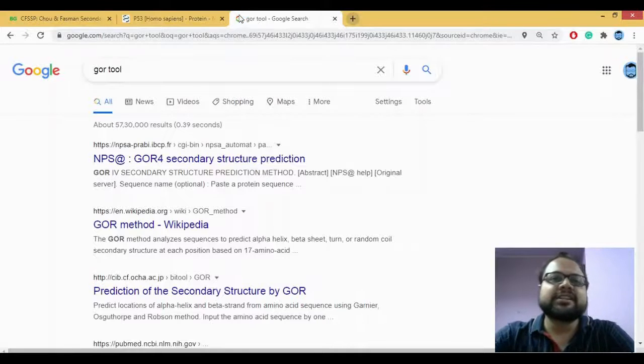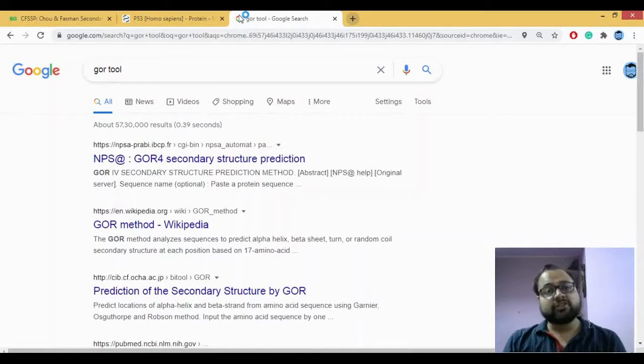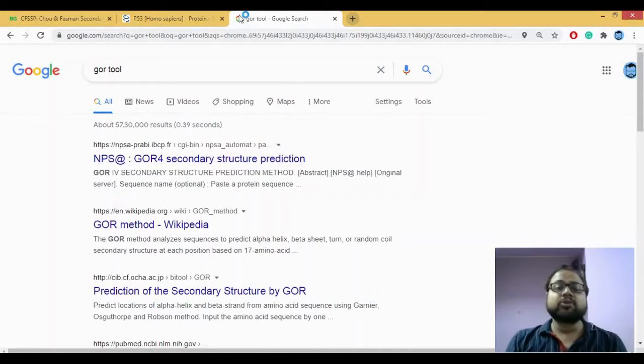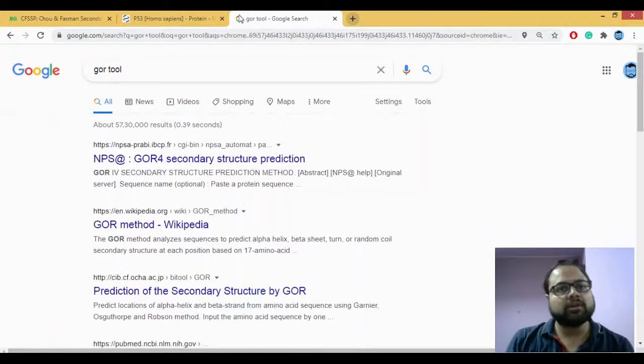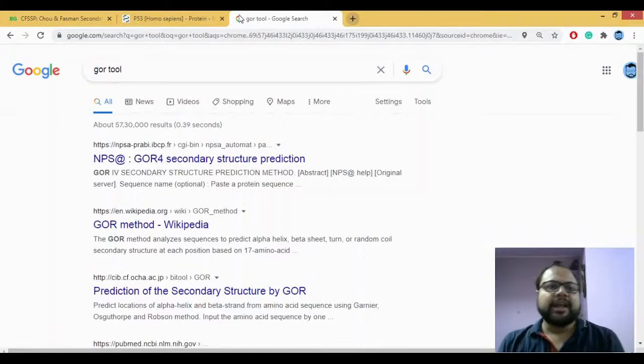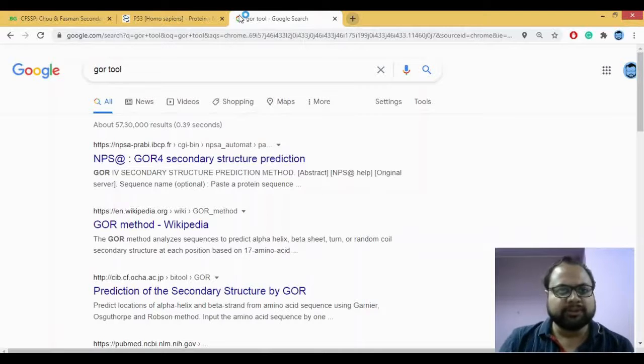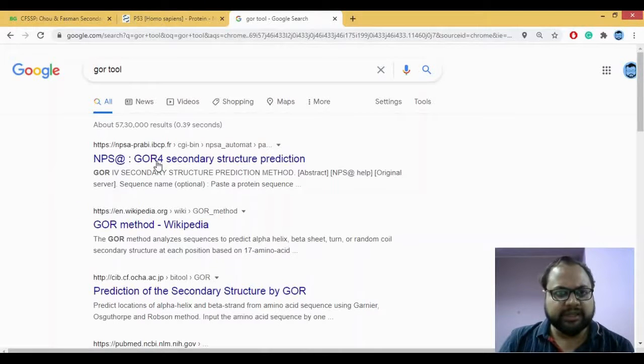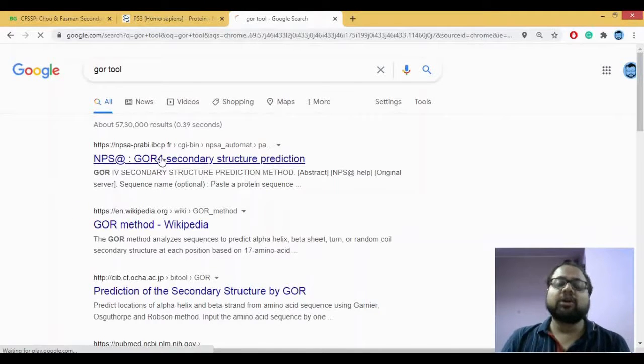Let's now understand how secondary structure prediction can be performed using the GOR tool. You go to Google, type GOR tool, and go for the first hit which is GOR4.